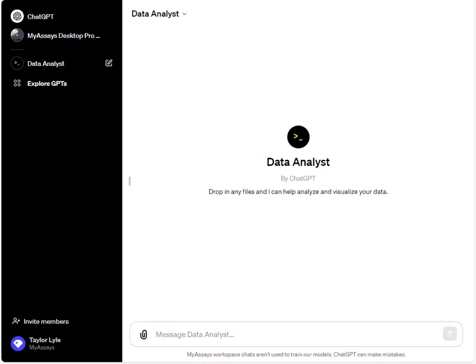In this video, I'll provide a review of using ChatGPT to analyze ELISA data. Artificial intelligence is an incredible tool for performing a variety of different tasks and could be used to complete ELISA data analysis. I'll provide a demonstration of how this is possible, as well as the advantages and disadvantages and some of the caveats of using AI systems for data analysis.